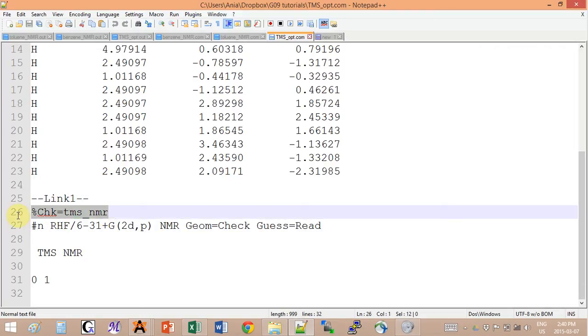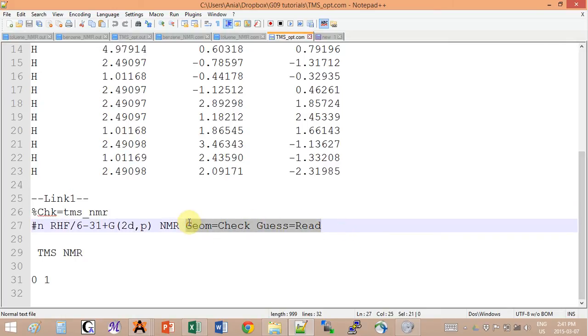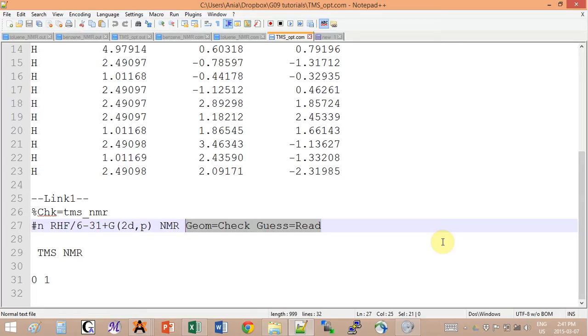This line tells it where to read the coordinates from and the molecular orbitals from. So geom check and guess check read - these are the keywords that tell you like, hello, here we already calculated all that, you can just go check in a checkpoint file. You don't have to read all this.